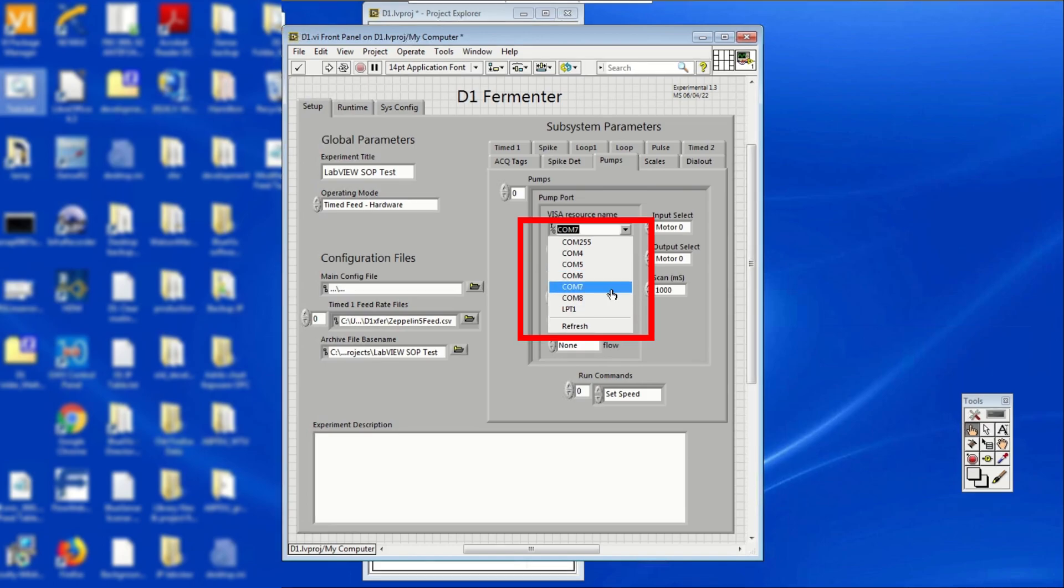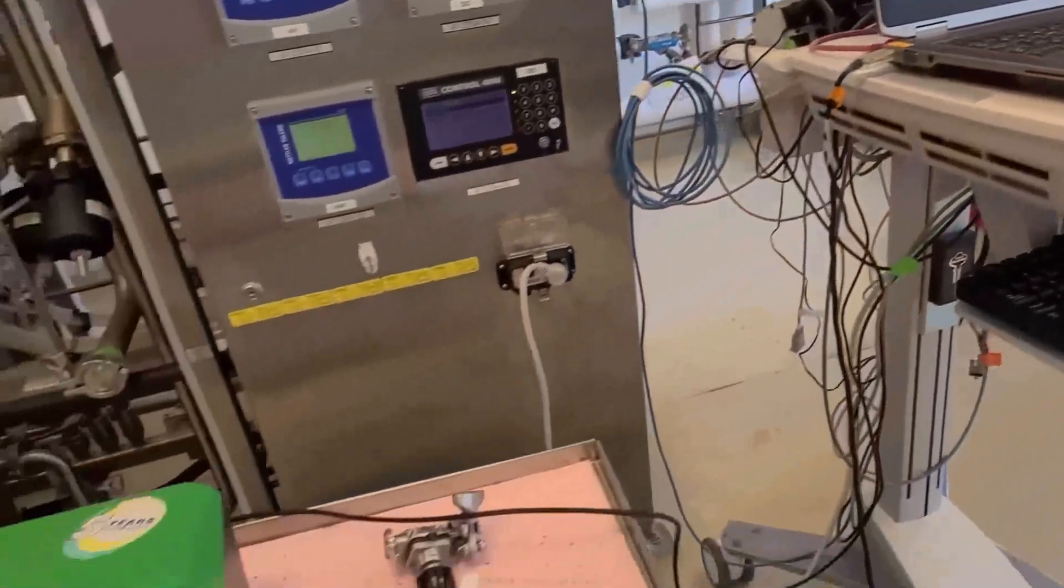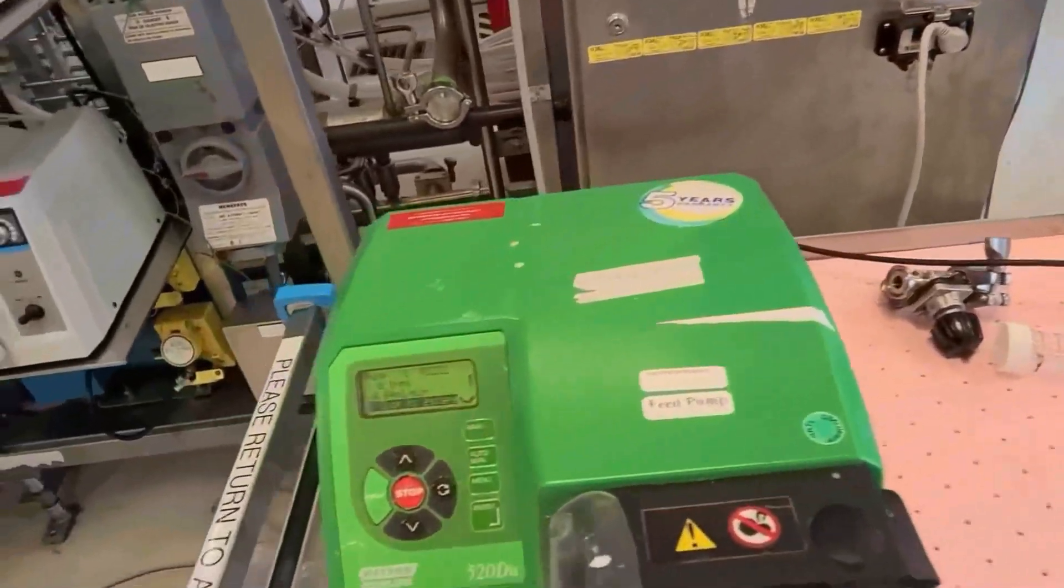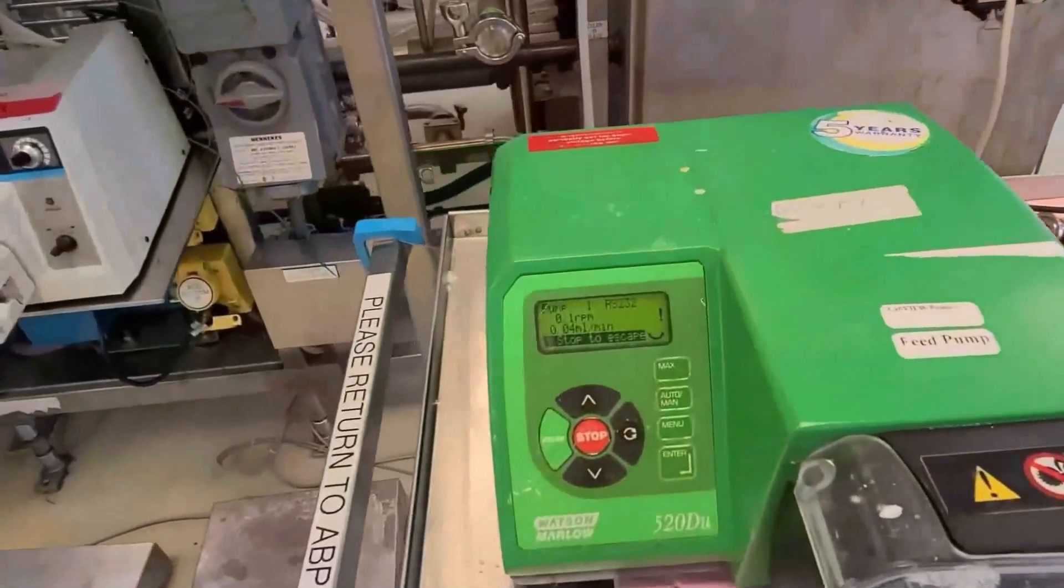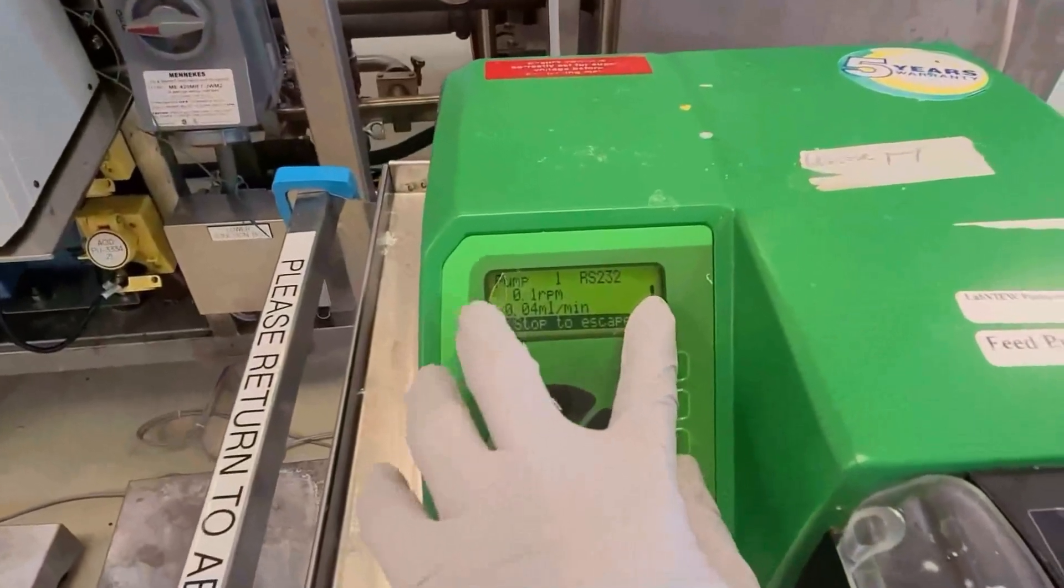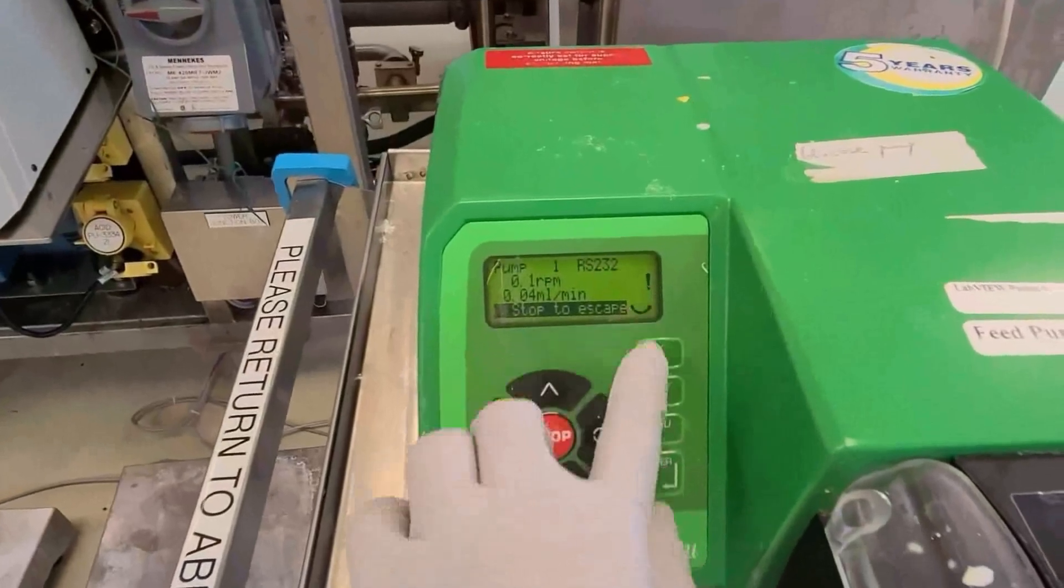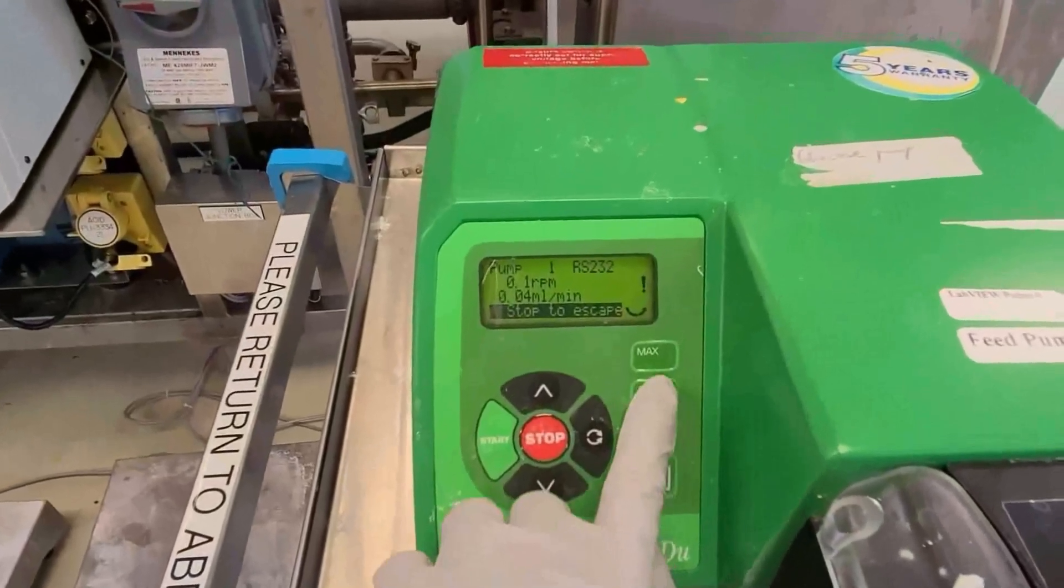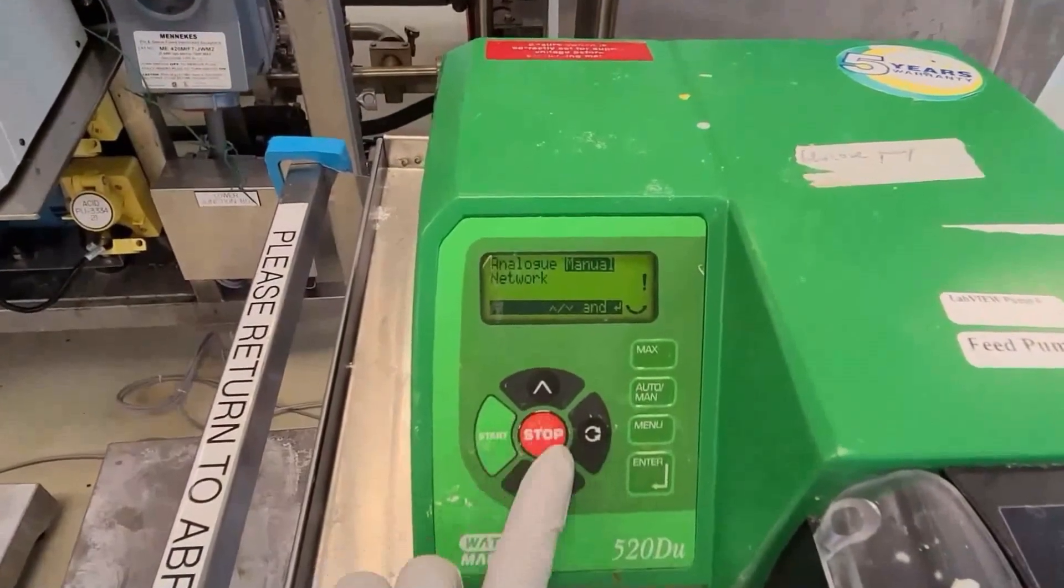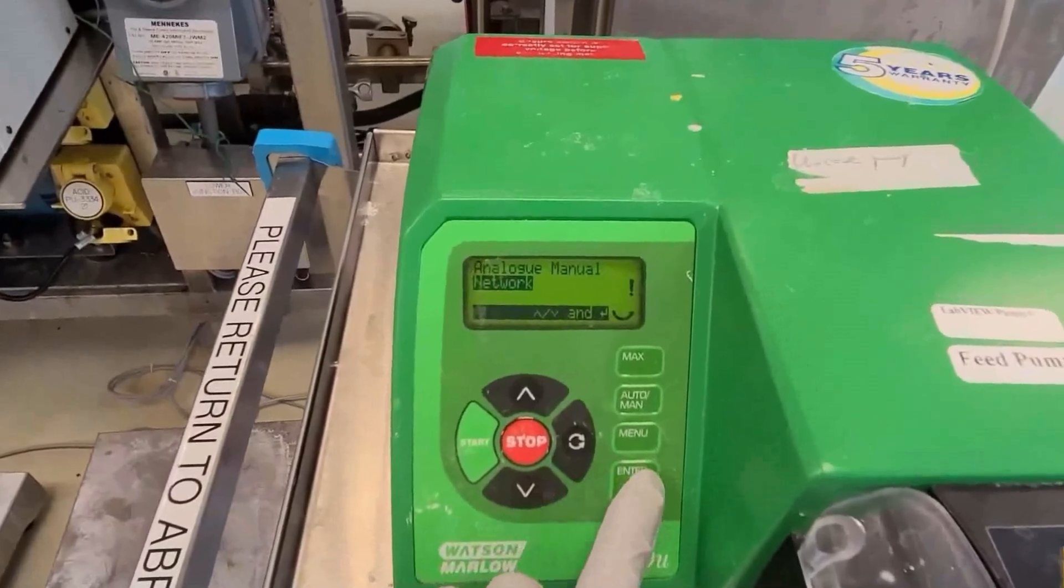Now is also a good time to check that the pump itself is in auto mode. The pump is in auto mode if an exclamation mark is visible in the screen. If not, press the auto slash manual button and select network. Putting the pump in auto mode allows LabVIEW to control it.